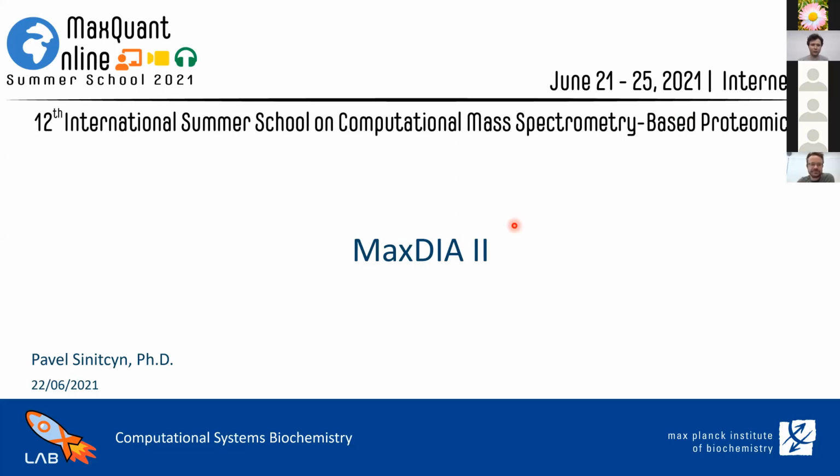And today I'm going to continue the story about MaxQuant applied to DIA. My talk is going to be mostly focused on the quantification and one application story. I think more stories and how to actually run MaxQuant, how to start MaxQuant DIA, Hamid is going to talk about in the next tutorial.